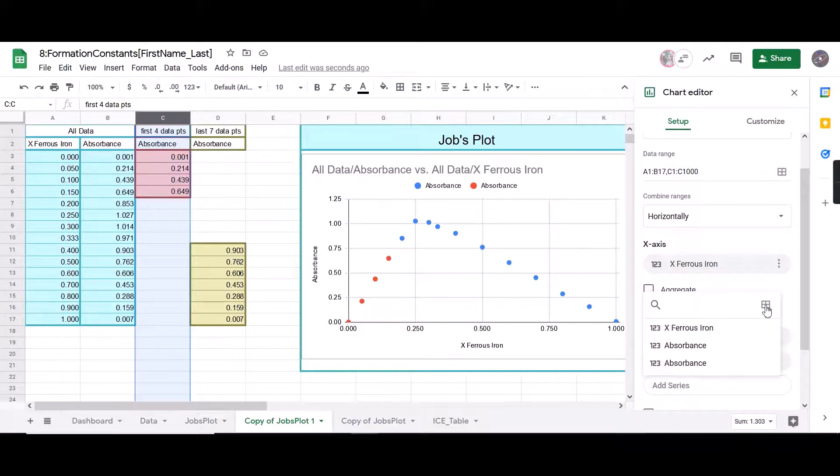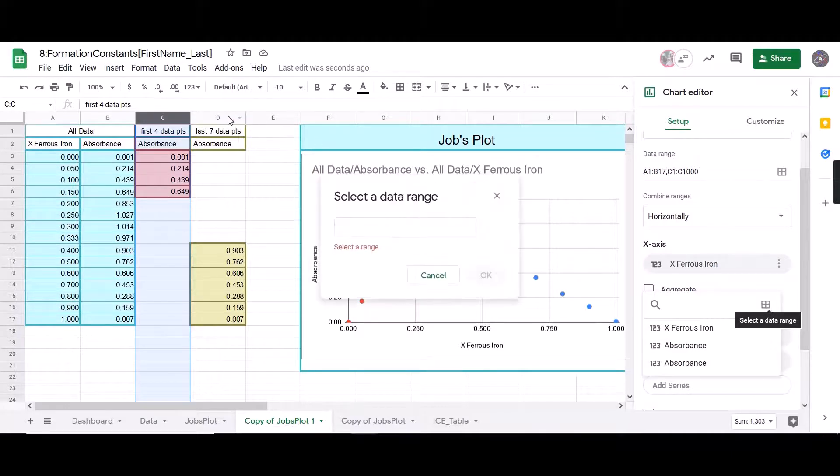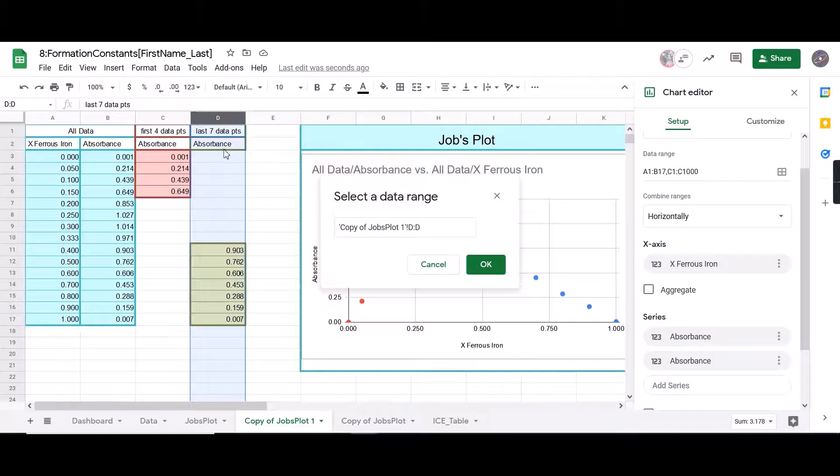Next, we're going to add another series, select a data range, and we're going to select all of column D. Once again, all of the column, not just the numbers.